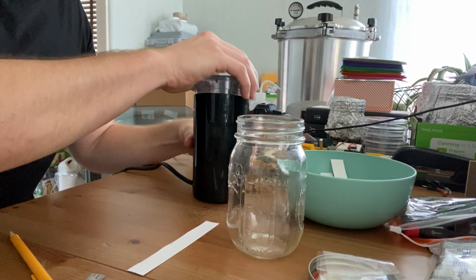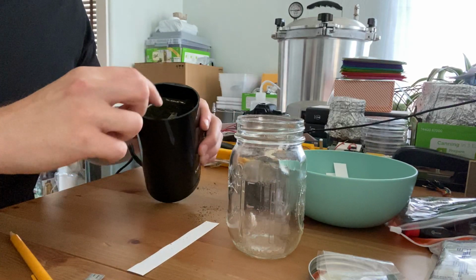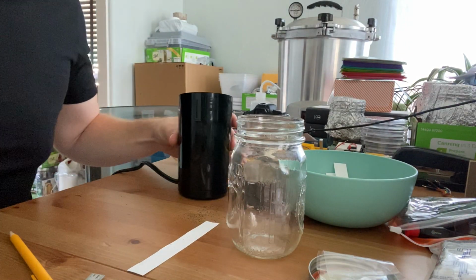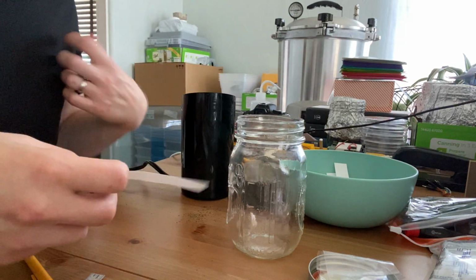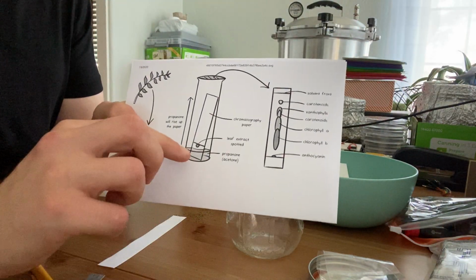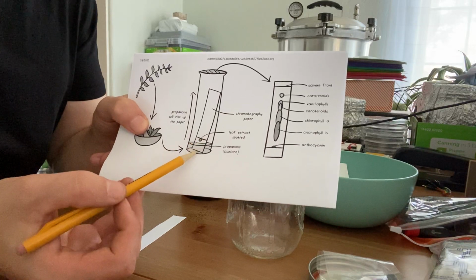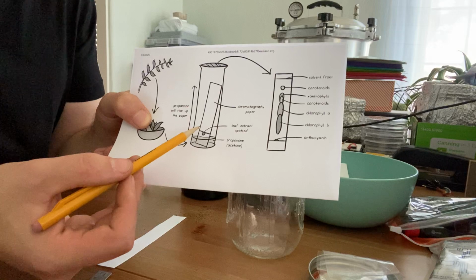And we basically want to grind it enough that we can take some of the natural extract of the leaves, the natural oils and stuff, and be able to transfer that to this paper. The other thing I'm going to do is mark the origin on the paper. And the origin is an important demarcation. It's this little line right here in the paper. So I'm going to mark this 5 millimeters up from the bottom of the paper.